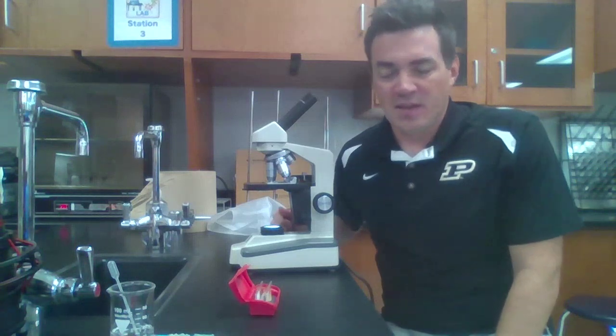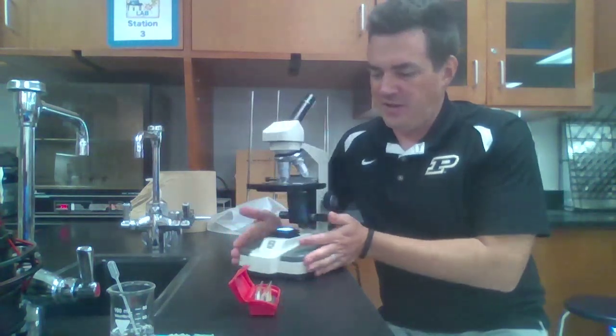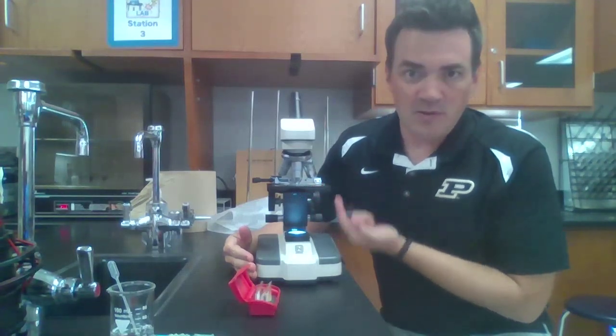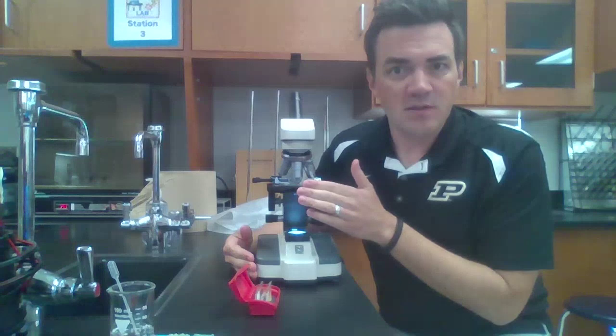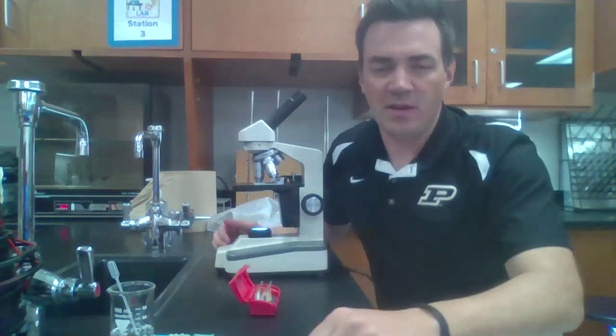If you can't see things very well, you might need to adjust how much light is coming through your microscope, and to do that, right on the front here is the diaphragm that adjusts how much light is going to be coming up from the underside. There are different numbers there. Right now I'm on 5, which is the most light. If I switch that to 1, it's the least amount of light. And so that might affect your ability to see things. If you need any help with the microscopes, just let me know and I'll come over and help you.